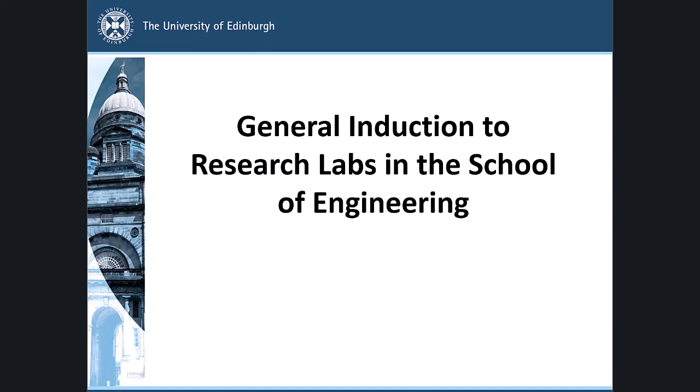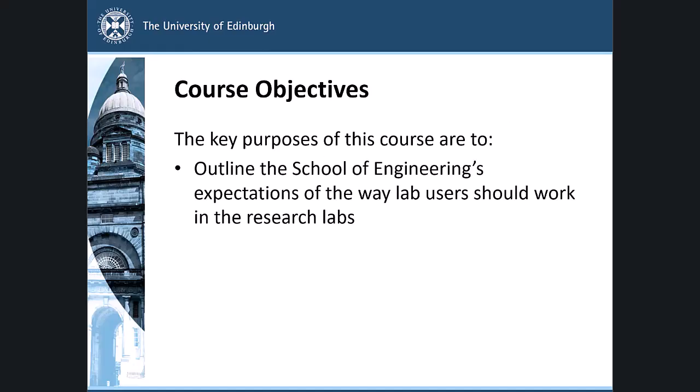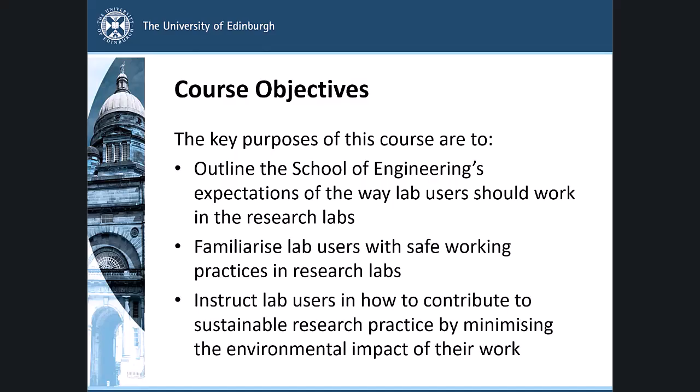Welcome to this general induction to research labs in the School of Engineering. This course has three main objectives: to outline the School of Engineering's expectations of the way lab users should work in the research labs, to familiarise lab users with safe working practices in research labs, and to instruct lab users in how to contribute to sustainable research practice by minimising the environmental impact of their work.